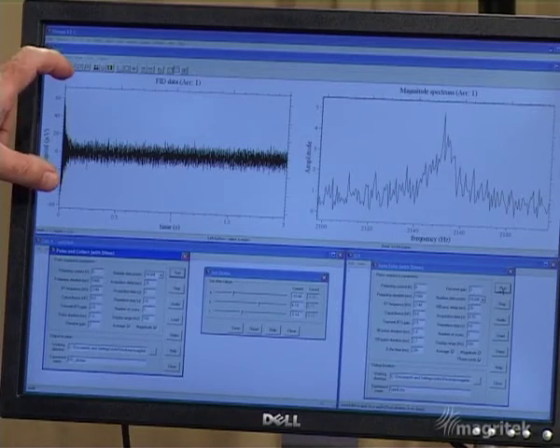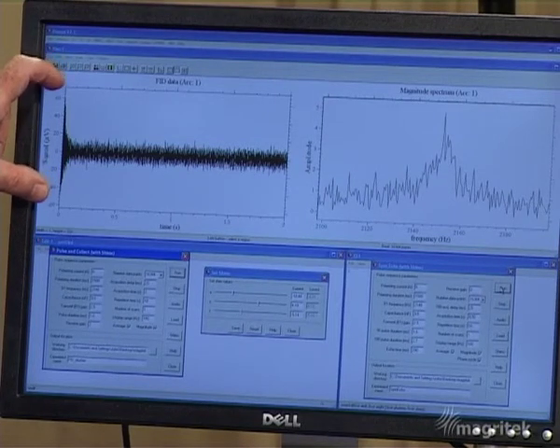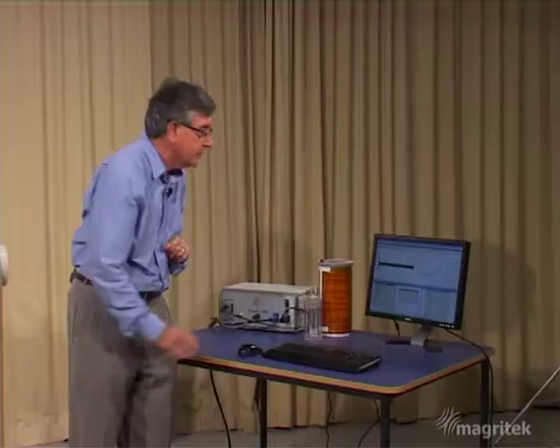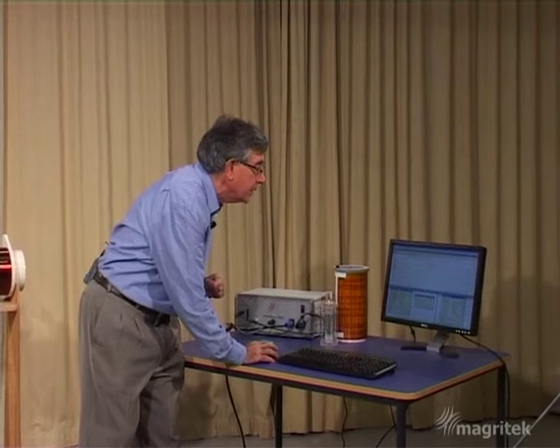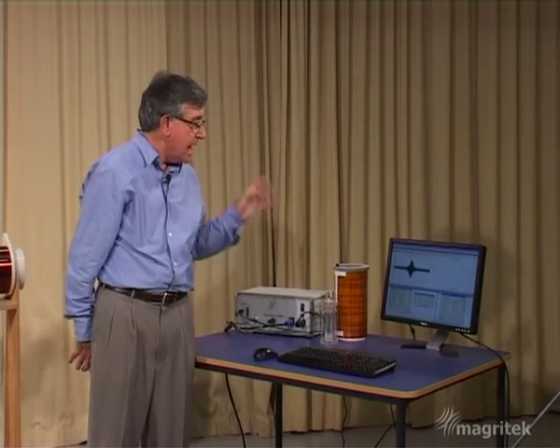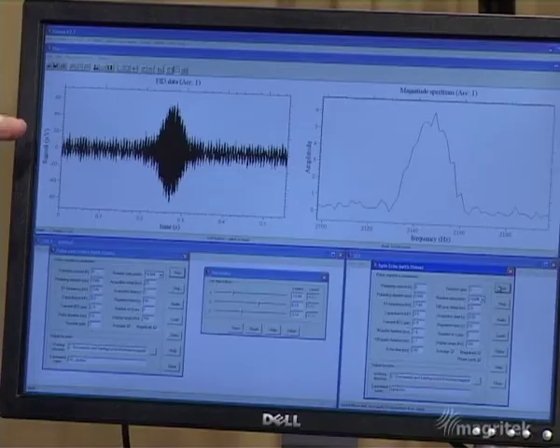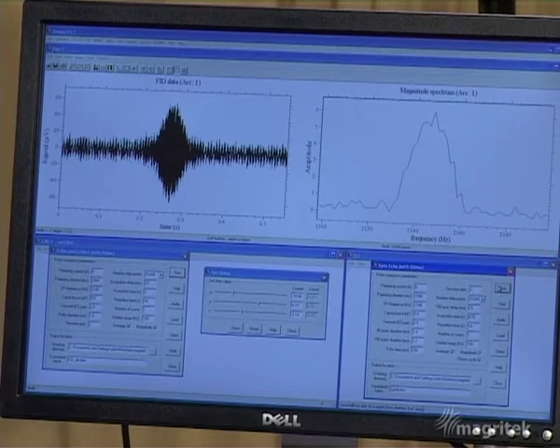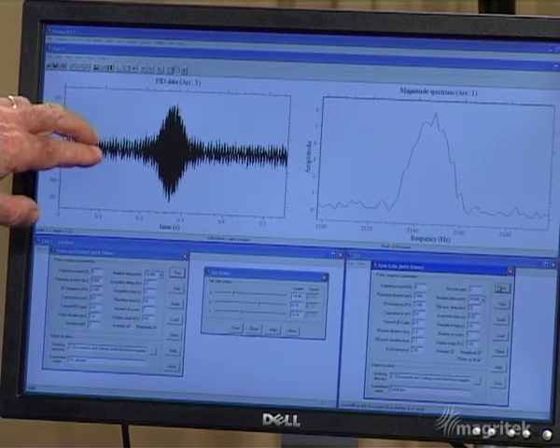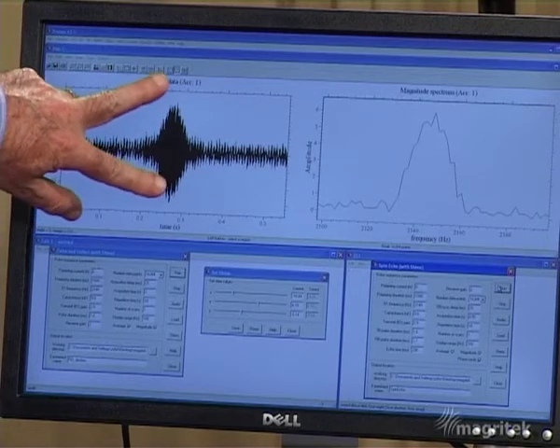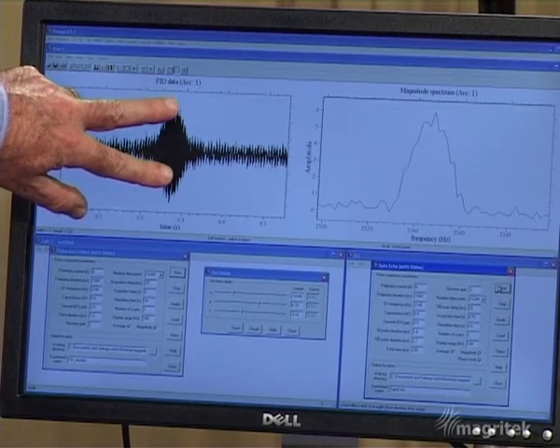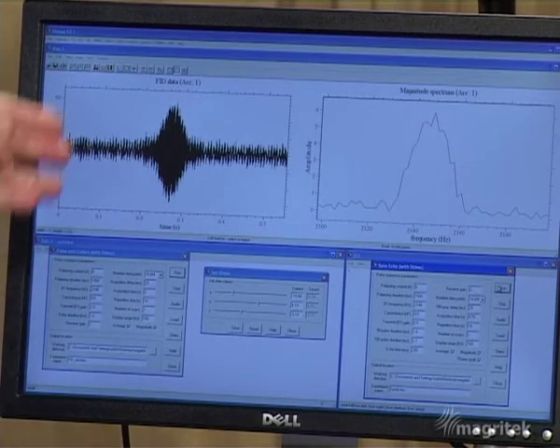Now we're going to carry out the spin echo experiment on the Terra Nova apparatus. We start with a 90 degree pulse, wait for the magnetization to decay away, and then apply the 180 degree pulse, using the fairly inhomogeneous magnetic field we have at the moment. What we see displayed is the signal obtained after the 180 degree pulse. In the centre we see the formation of the echo — spins precessing at different frequencies coming back into step to produce a maximum signal, then passing through with the fast ones at the front and the slow ones at the back, getting out of phase again.